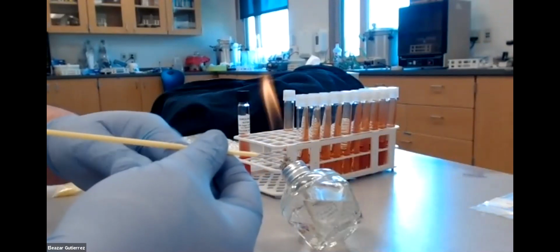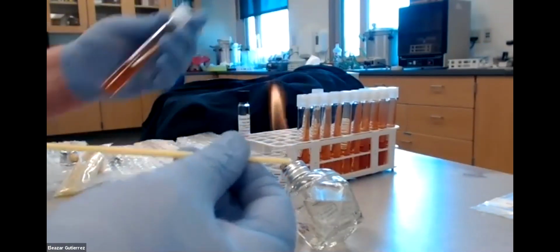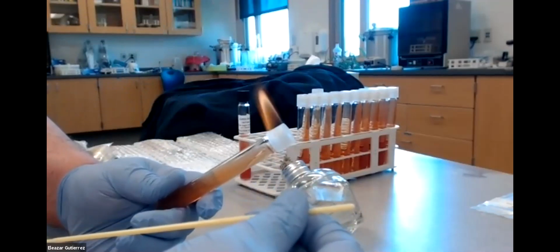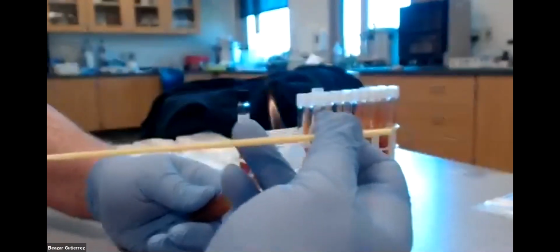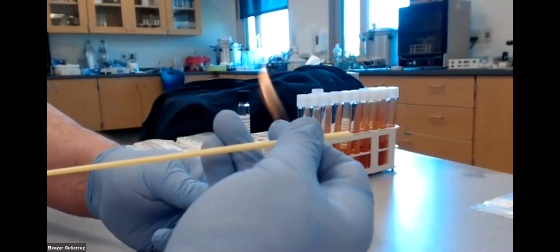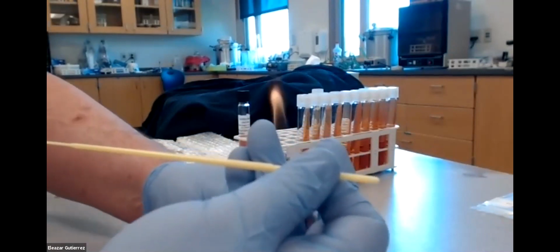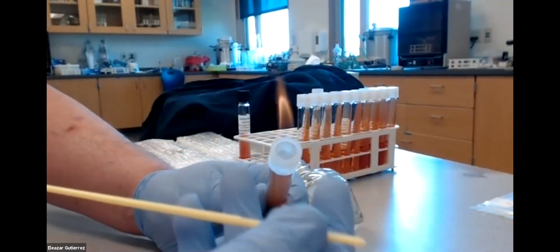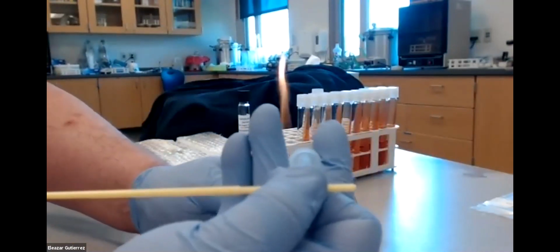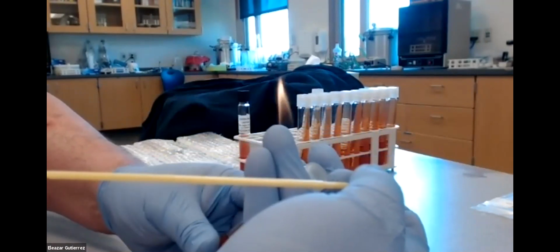Okay. Now I'm going to grab my TSI. I'm going to use the one that Chris made for me. There it is. With the back of my hand, I'm going to grab the cap. This is very awkward. I don't know if I should do it in the other direction. You guys see that? How I'm grabbing this with the back of my hand? Okay, just like so. And I'm going to unscrew it.